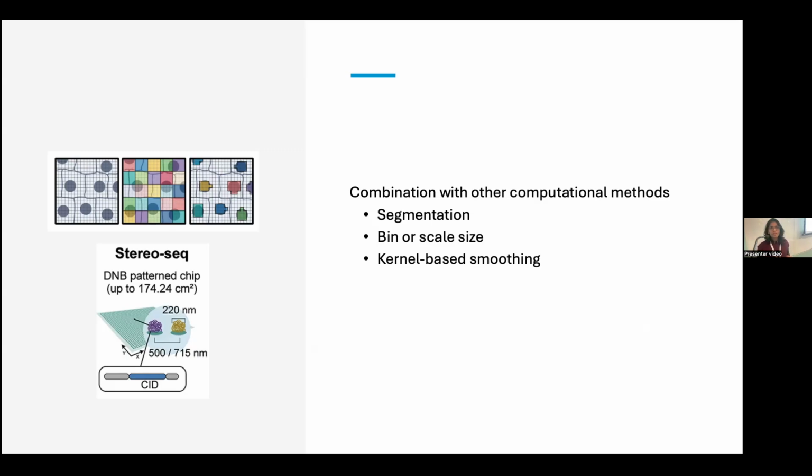I have had most of my failures when it comes to spatial clustering and identifying domains when I use TMAs, tissue microarrays. But also take note that I've been using tissue microarrays that are diseased. I'm not using normal tissue. I don't work with normal tissues. Most of my tissues are GBM or some sort of cancer, some sort of disease.